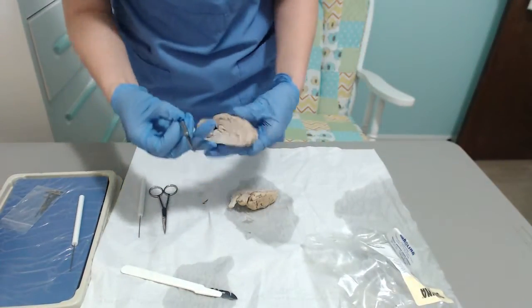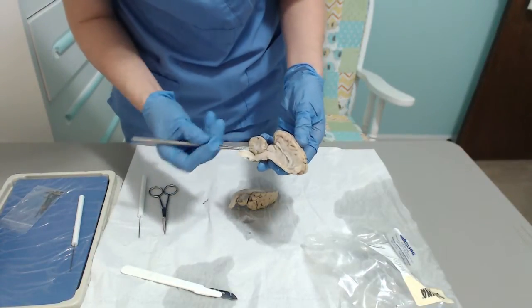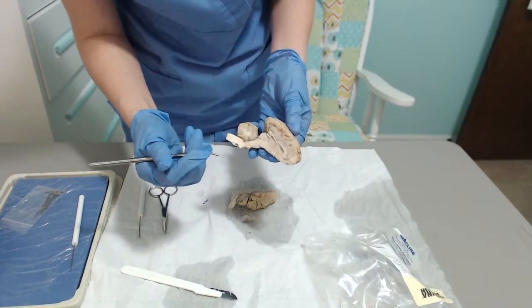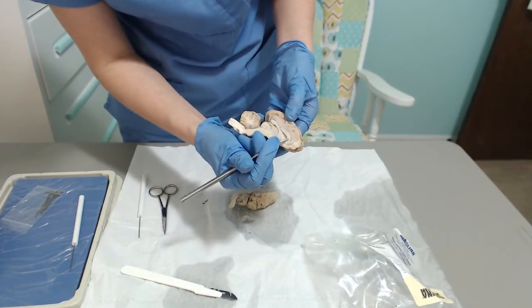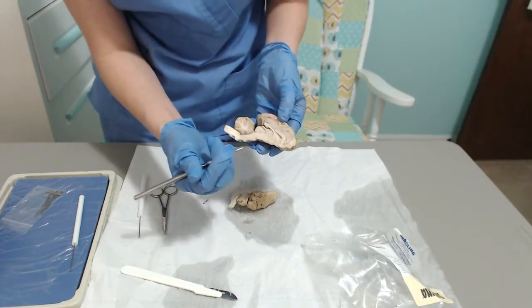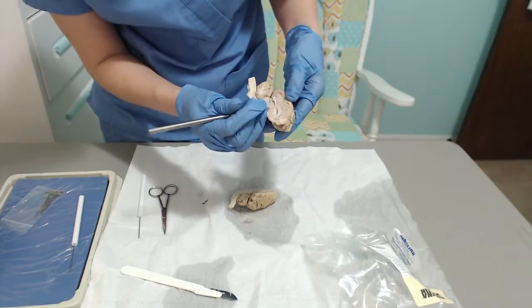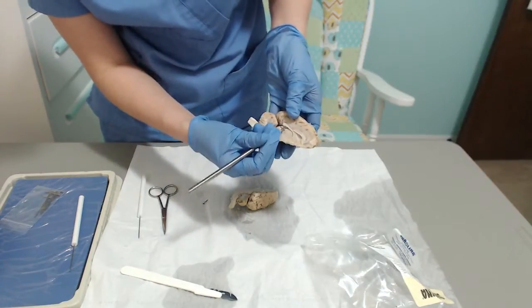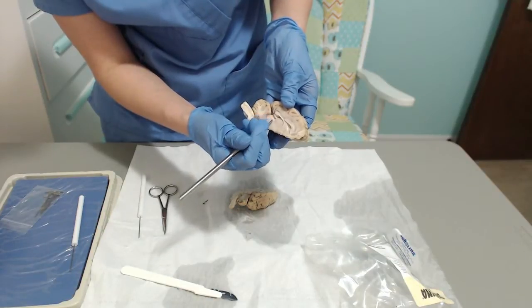Okay, so now that we have it dissected, in the center we can see, of course, there again is the cerebellum. And the first thing we're going to look at after that is the corpus callosum. So the corpus callosum is this white area right here. The diencephalon, which consists of the thalamus and hypothalamus. Thalamus and hypothalamus is right in here. So the thalamus is right here, and the hypo is right below the thalamus.